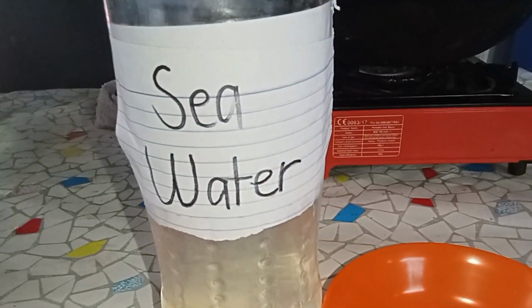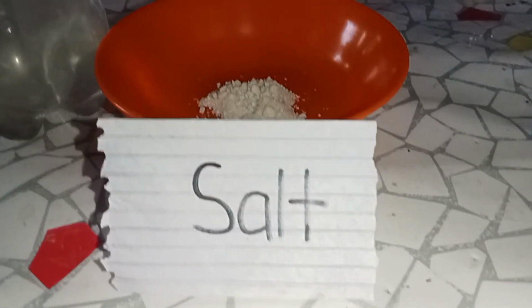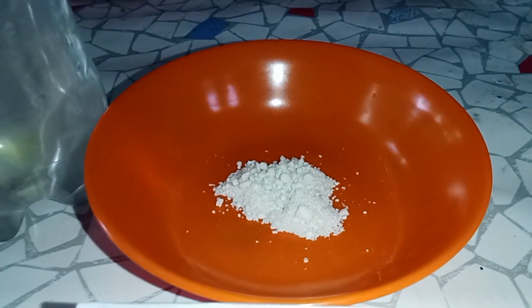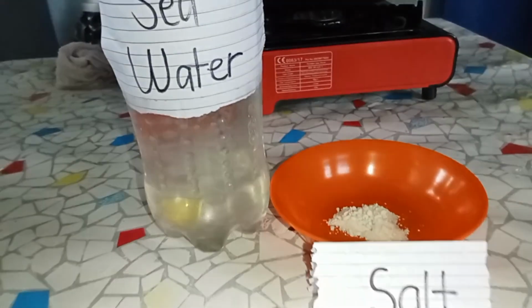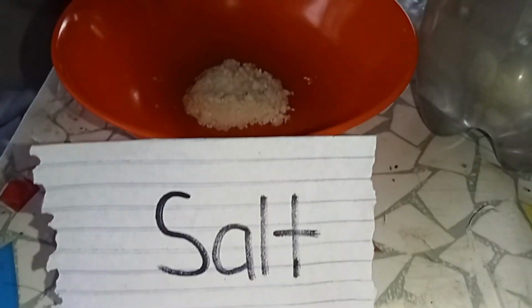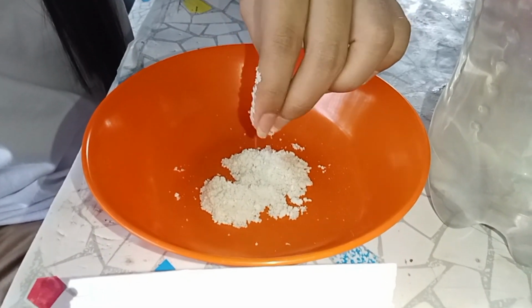This method is widely used in the production of table salt from seawater in salt beds or salt farms. It is also used in laboratories to recover dissolved solids from liquid mixtures. And here's the final result.